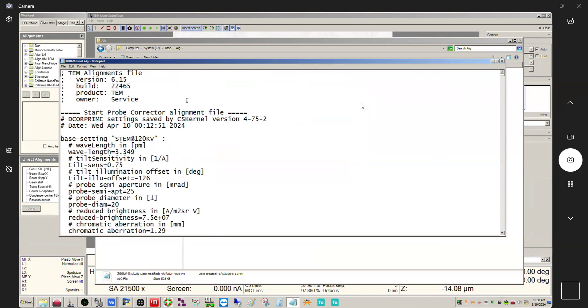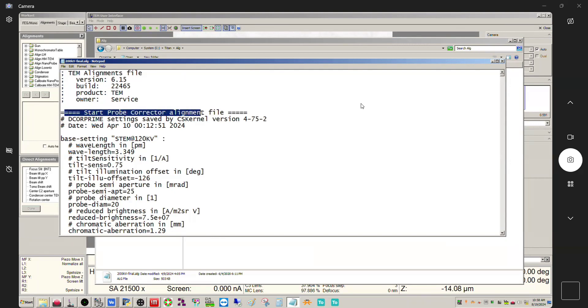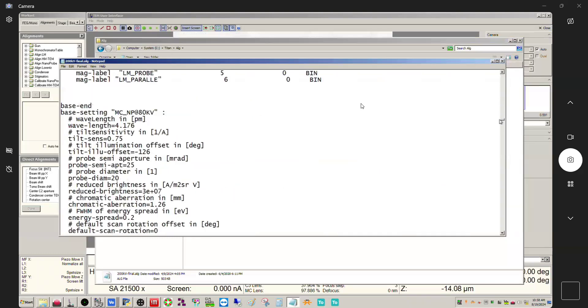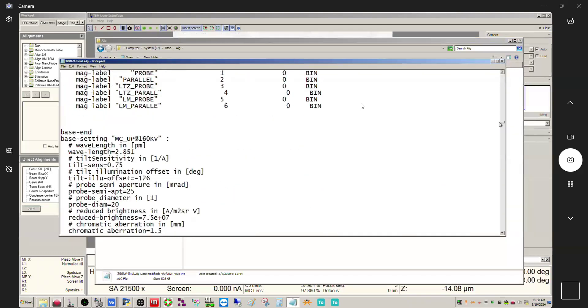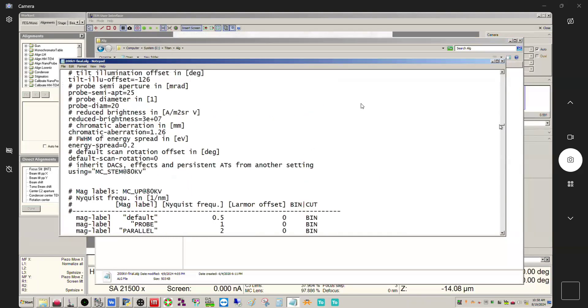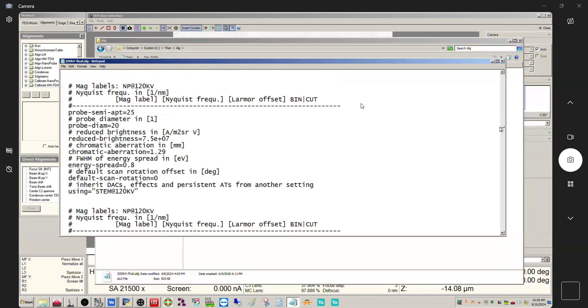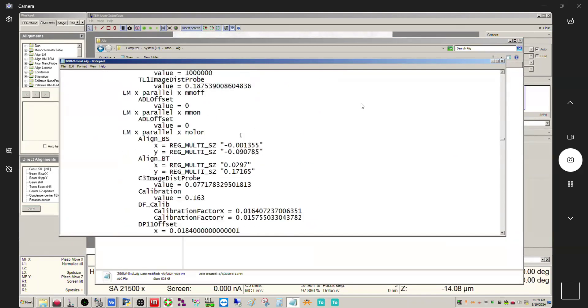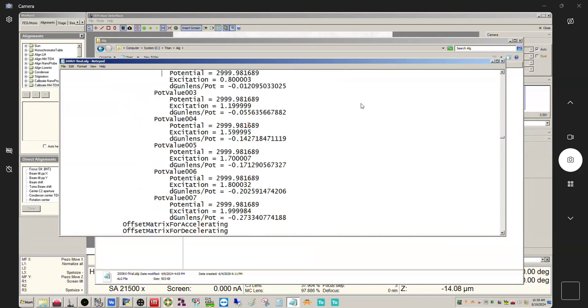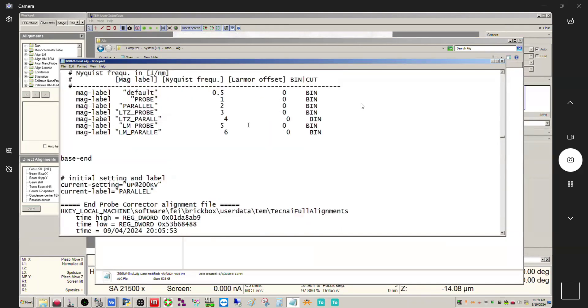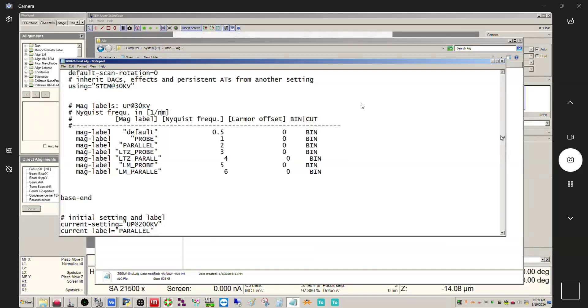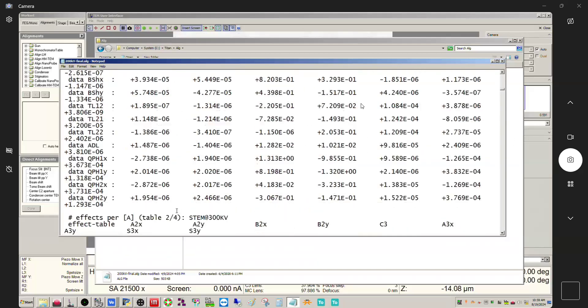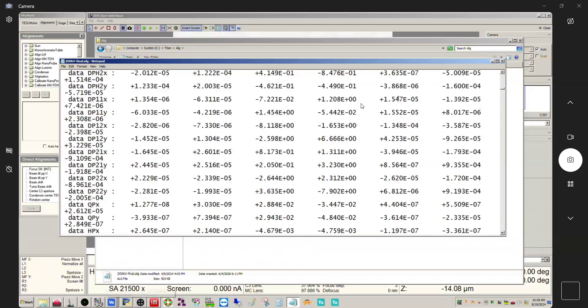About one third of this file is actually for the probe corrector. This system has a probe corrector on it. If you don't have a probe corrector you're not going to see any of this. But about one third of this file is actually for the probe corrector. You see where it says start probe corrector alignment files. If we scroll down through here, right here - end probe corrector alignment. Actually it's more like 40%, I would say 40% of the file is the probe corrector alignment.